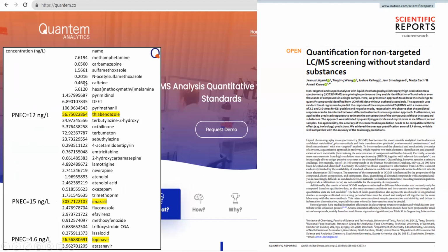But also for this data, the way I estimated these concentrations, because we have the SPE happening, on the SPE you don't always have 100% recovery. If you load a compound onto the SPE and you elute it, you might end up with less than what you had before. So for all these predicted concentrations, I assumed 100% recovery rate. So within the uncertainty, it's a rather low estimate. It could be way higher, or it could still be borderline okay.